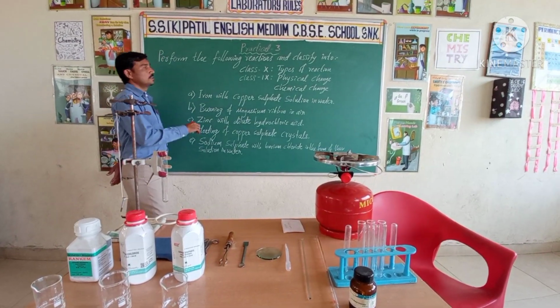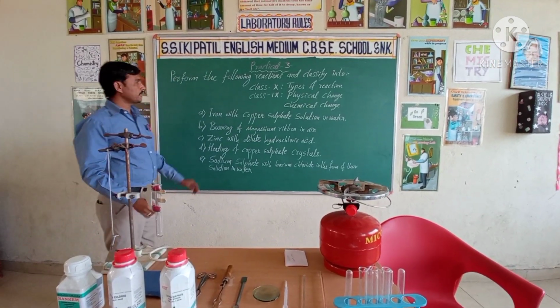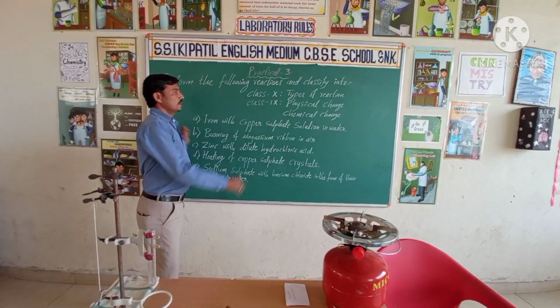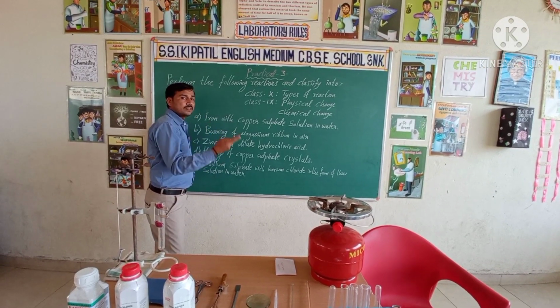Hello everyone, today we will perform practical number 3. What is practical number 3? Perform the following reactions and classify them. Here I made the same practical; it helps for both classes.